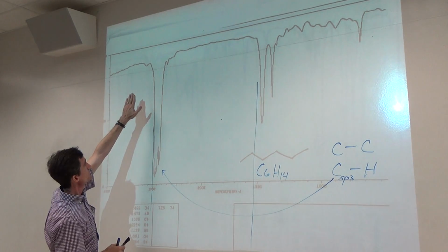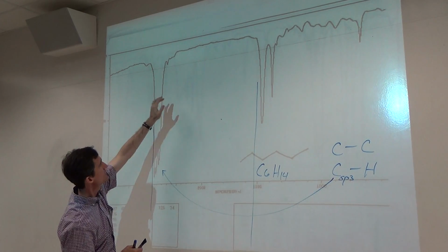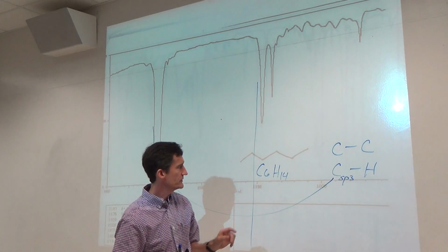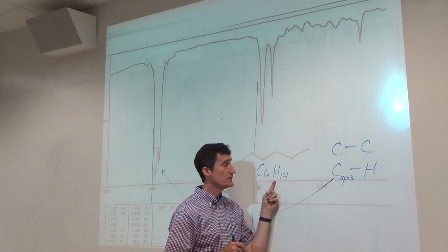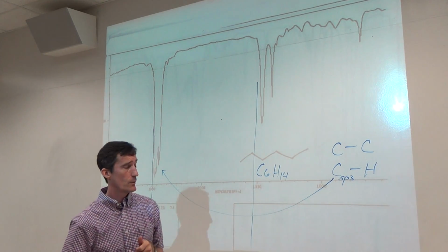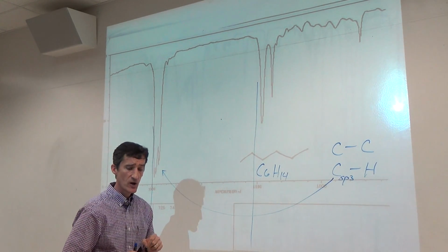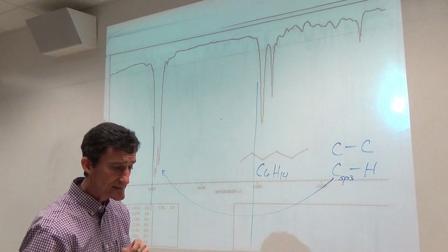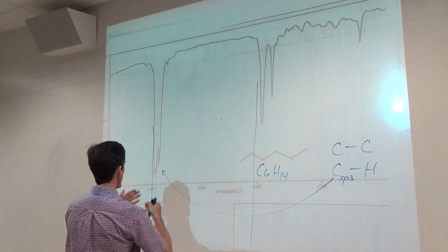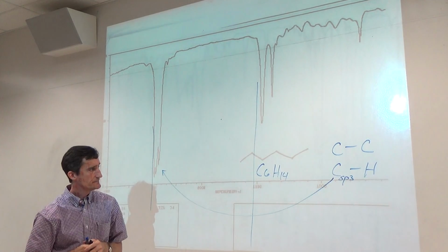That's really not an absorbance. Well, we need to learn when is it a peak, when is it not. There's no absorbances here, not much here, and then fingerprint. One word of caution, there are 14 CH bonds in this molecule. That does not mean we're going to get 14 absorbances. We may have strong, we may have weak. You cannot quantify like that in IR, at least not easily, and not at the introductory level. We know that we have some sp3 CH, and indeed we do.